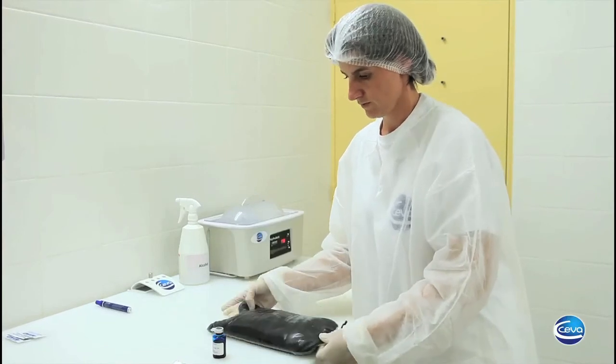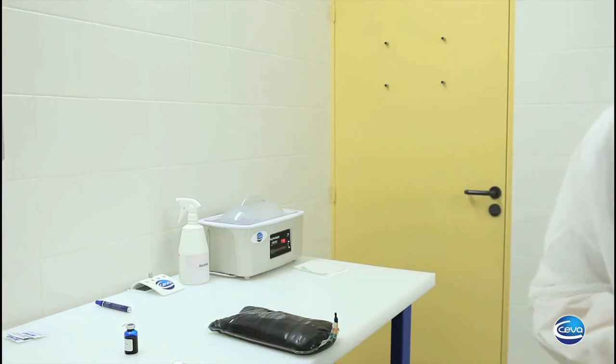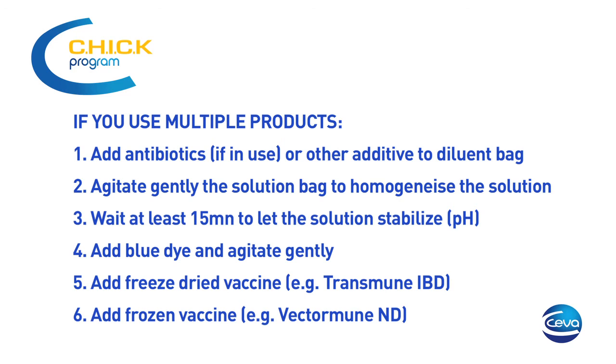Finally, dispose of all disposable items and clean your work area before leaving the vaccine preparation room. Add antibiotics or other additive to diluent, if in use. Agitate gently the solution bag to homogenize the solution. Wait at least 15 minutes to let the solution stabilize. Add blue dye and agitate gently. Add freeze-dried vaccines. Add frozen vaccine.